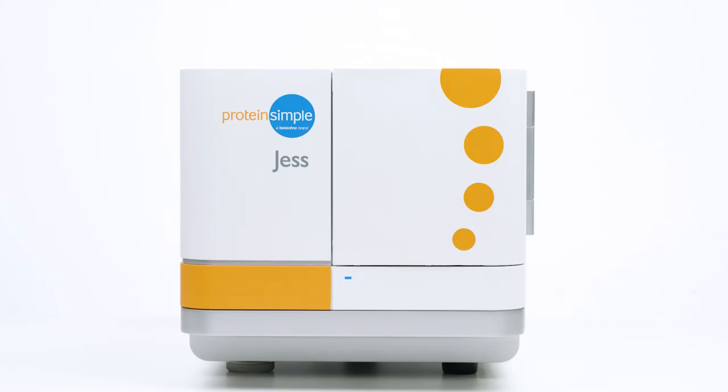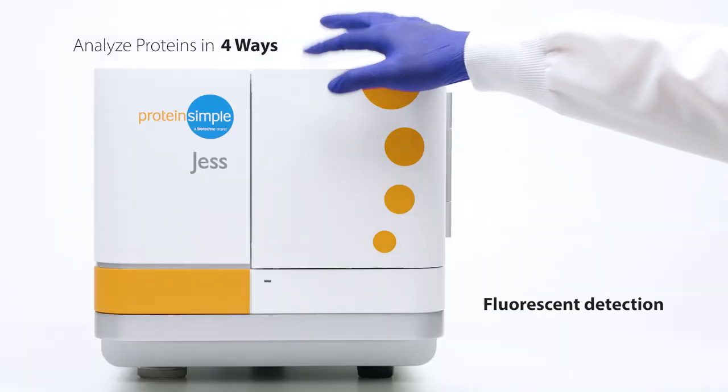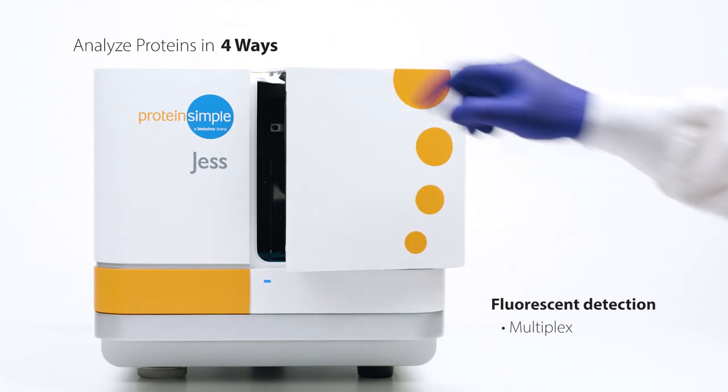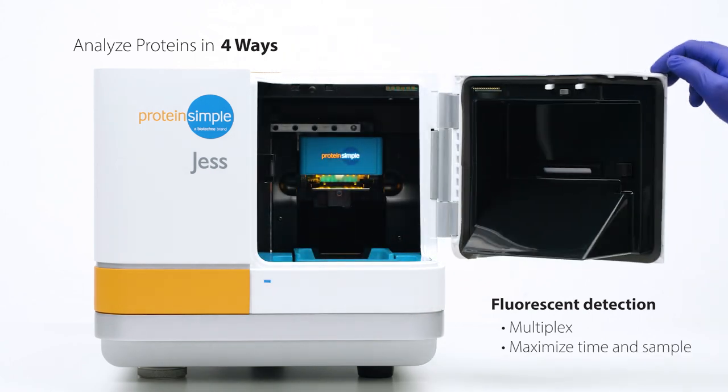Jess, she's like Western blot meets ELISA in one. Jess gives you four ways to analyze proteins. Her fluorescent detection enables multiplexing, letting you maximize your time and sample.